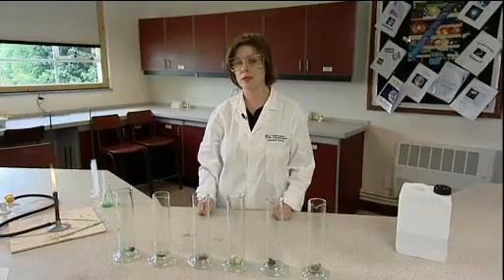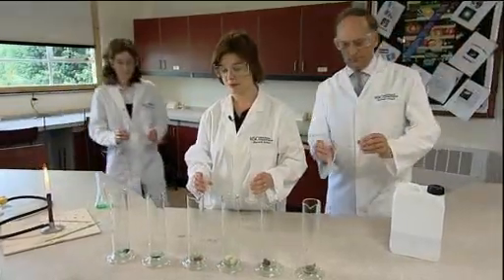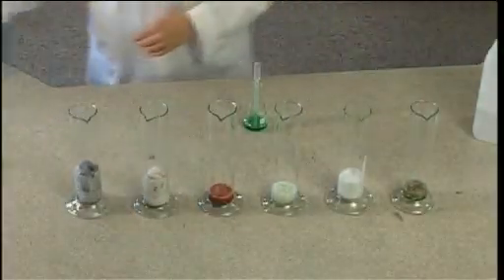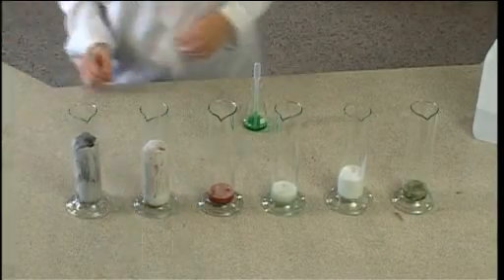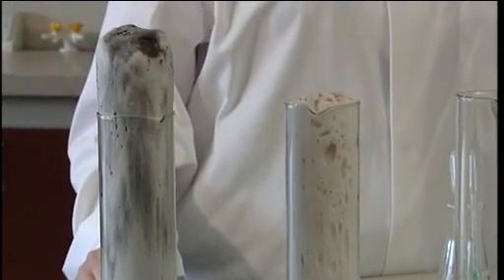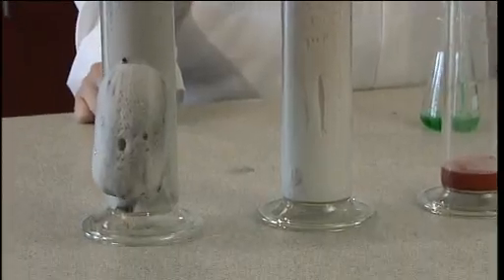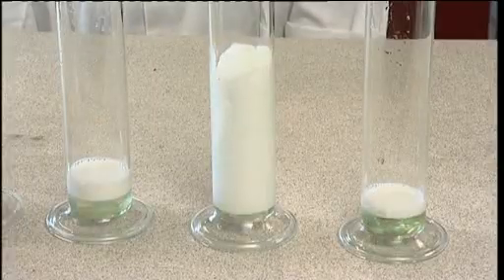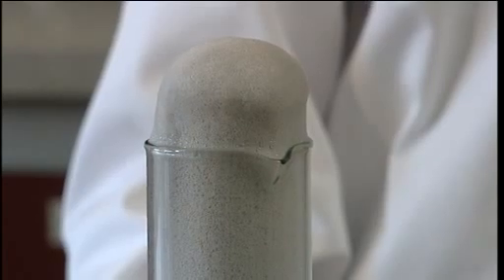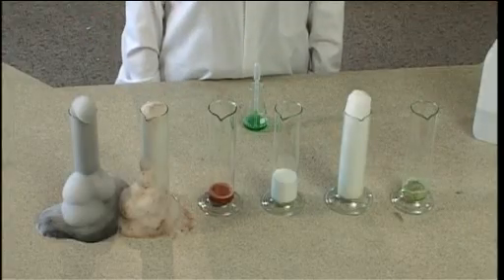Then simultaneously add 25 centimetres cubed of 75-vol hydrogen peroxide to each of the cylinders. The foam will rise up the cylinders at widely differing rates. The foam is formed from oxygen which is produced by the decomposition of the peroxide. The rates at which they rise up the cylinders give a graphic comparison of the differing effectiveness of the catalysts.